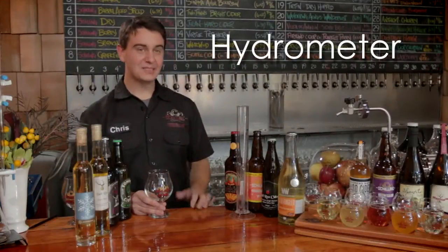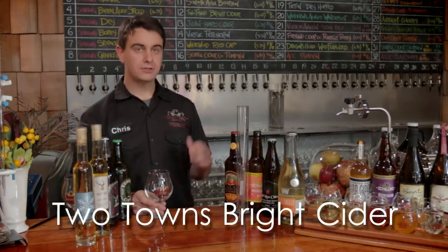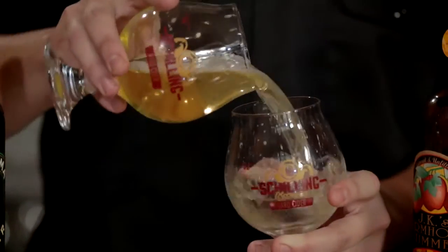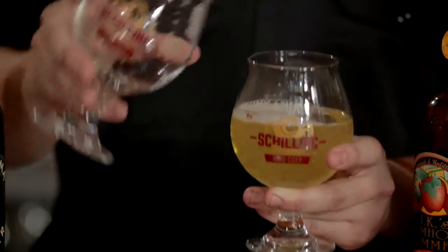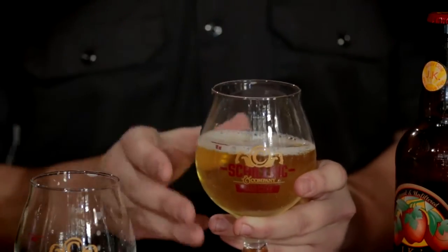The way that BRIX is measured is with a hydrometer. Today, to demonstrate the measurement of BRIX, we will be using Two Towns Bright Cider. There are a few things we need to correct for to get an accurate sugar measurement. First and foremost is carbon dioxide — I will degas the cider by pouring it back and forth until there are no more visible bubbles. We can still see some tiny bubbles in there, but that is not going to throw off the reading by any discernible amount.